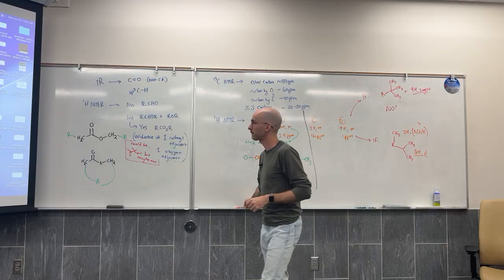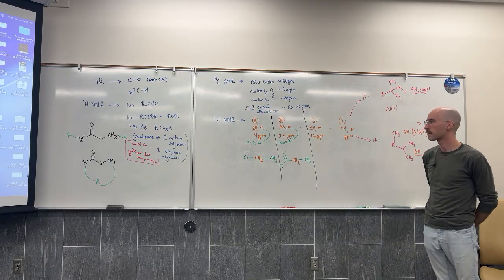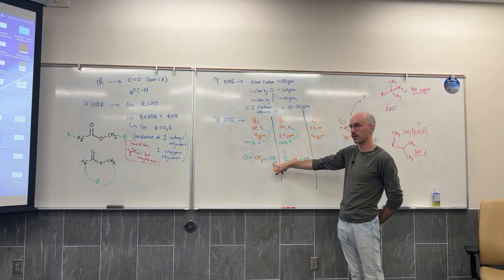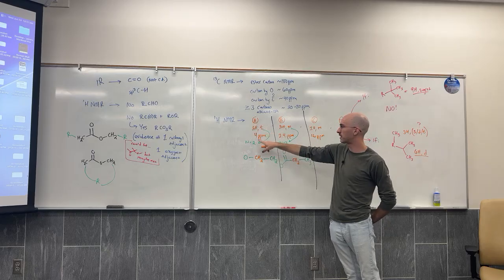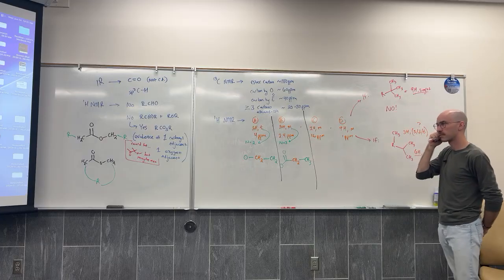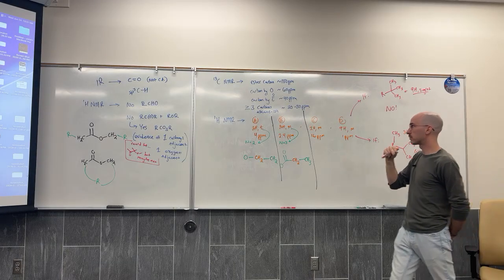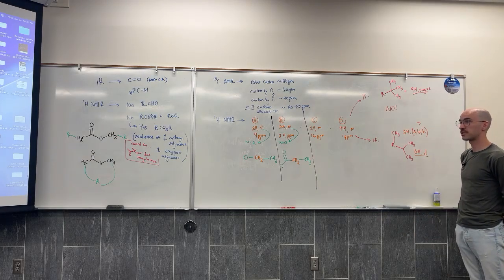Tell me, why do you have 3 CH2s right there, but only 2 on your structure over here? This is not a CH2 that I have determined anything about. Oh, that's a question mark. It's in green because it's a prediction. What's in orange is what we're getting from the signal. Oh, gotcha. So that's 3, and you don't have 3. Good point. We don't have 3, but that's just the best that our prediction is giving right now.